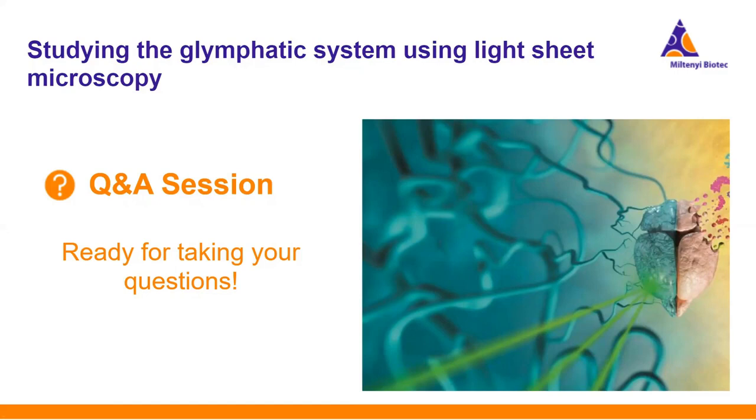Yes, this is actually something that we are dealing with at the moment. We have a reporter mouse expressing EGFP, and unfortunately, the GFP signal is not visible after the clearing. So what we're trying now is nanobody labeling.